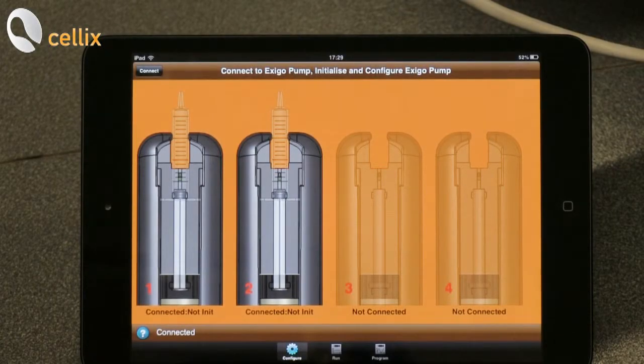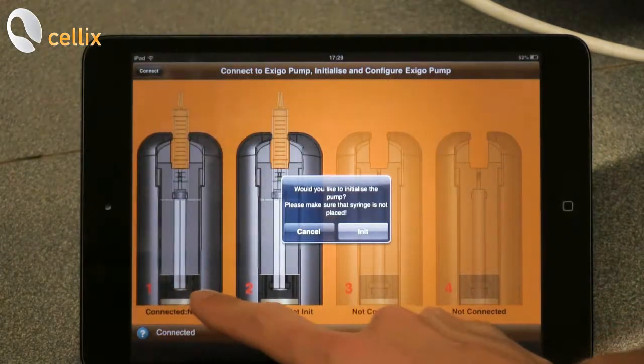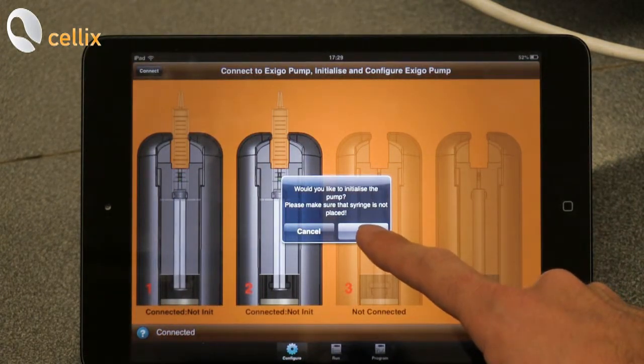In order to be able to use the pumps we have to initialize them. We click on the syringe guide and we click initialize.